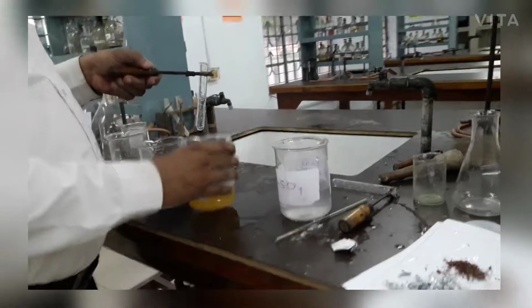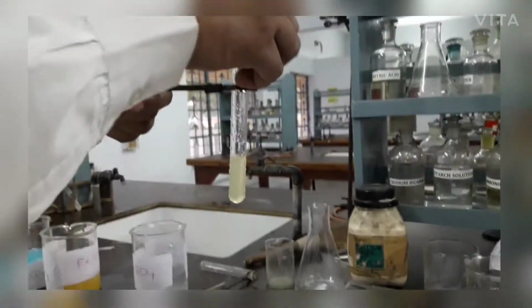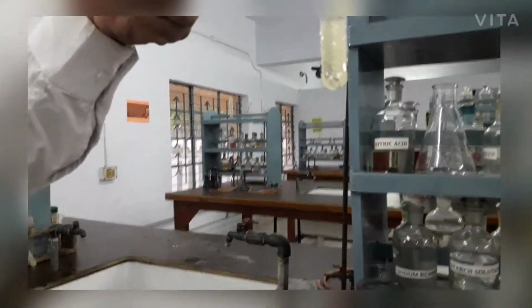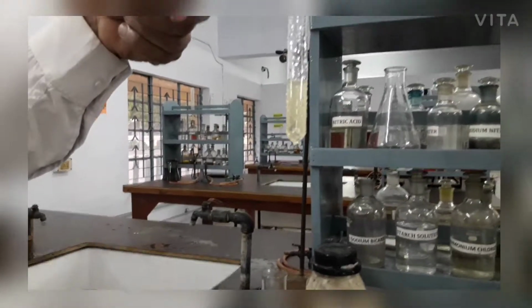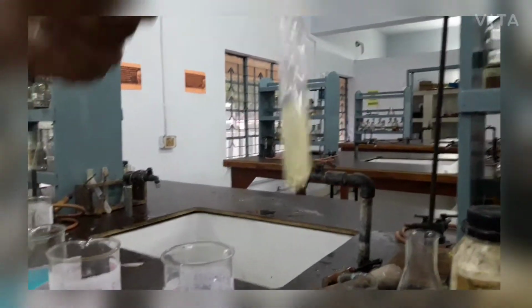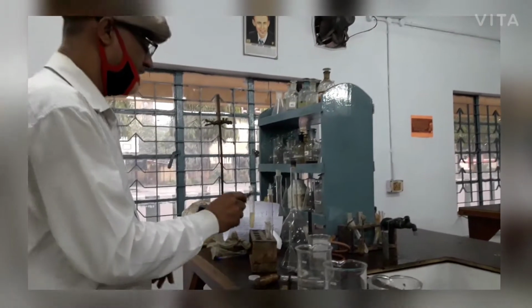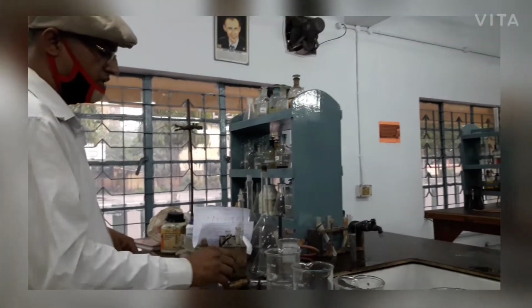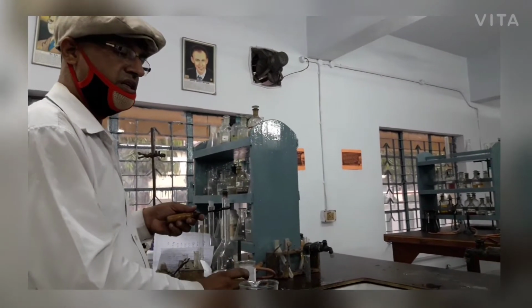Again we are taking iron sulfate solution and we are adding zinc and we observe. It takes time, so we keep it here because this reaction takes time. Now we take aluminium sulfate, and zinc sulfate.